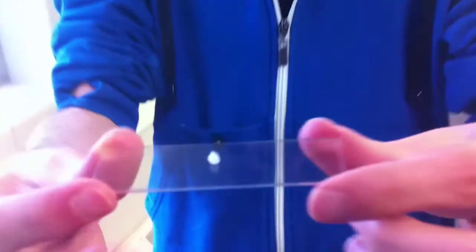We transferred the pellet of DNA from the Eppendorf tube to a slide for further analysis. Right here we have methylene blue dye — we're going to add one drop to our DNA sample.